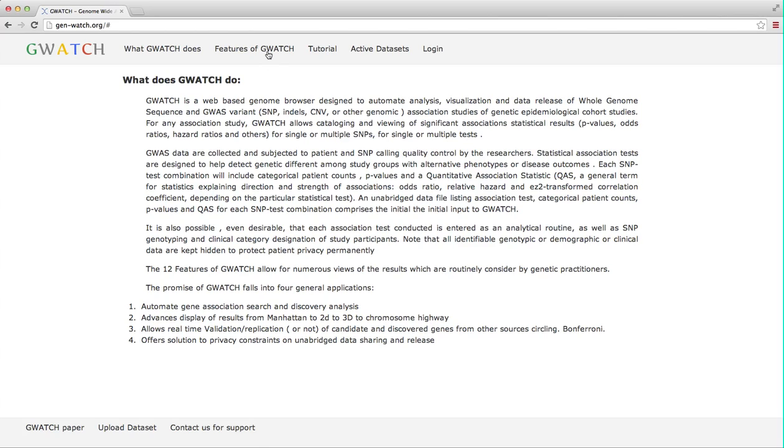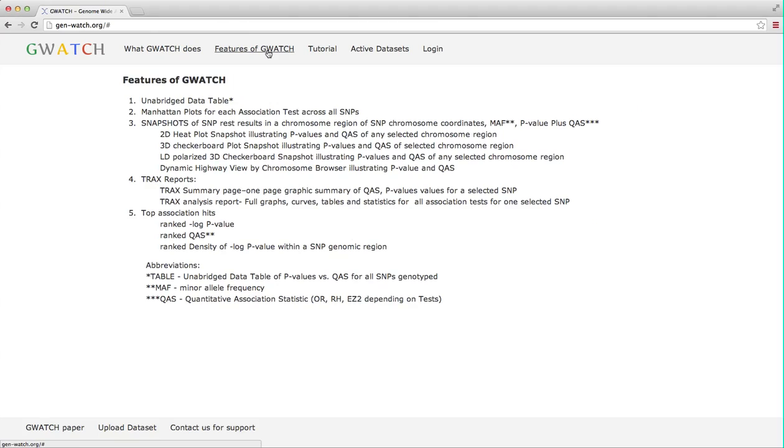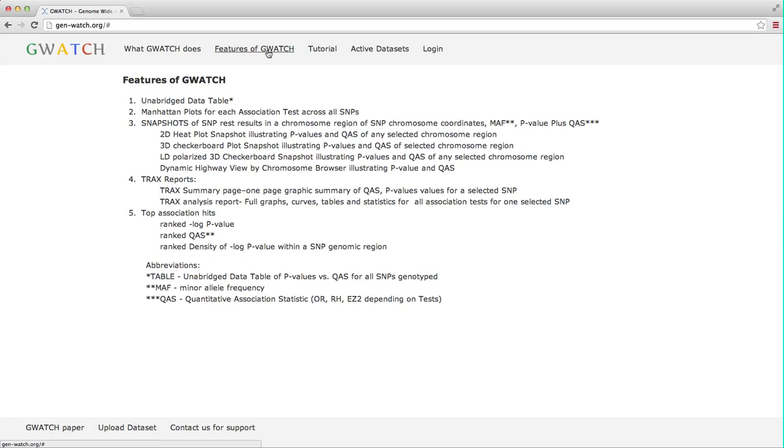The features of GWATCH section is the explicit listing of the principal output formats of GWATCH. I shall mention a few: a large unabridged table of p-values and quantitative association statistics or QAS for a given GWAS dataset. QAS is a general term for the statistics showing strength and direction of association, which lumps together such values as odds ratio, relative hazard and so on. Manhattan plots for any test that is performed.